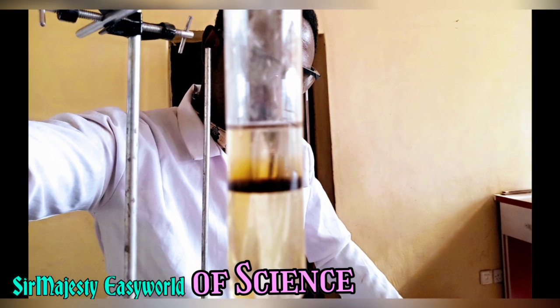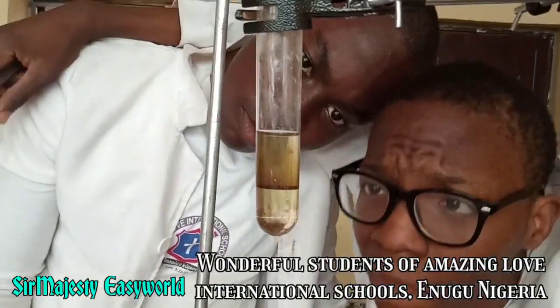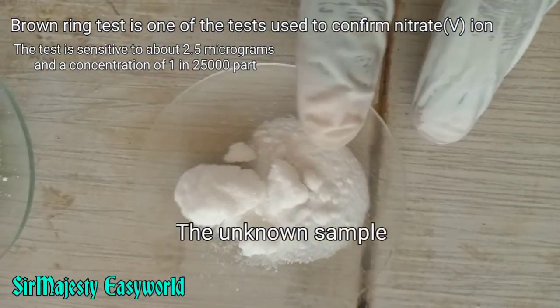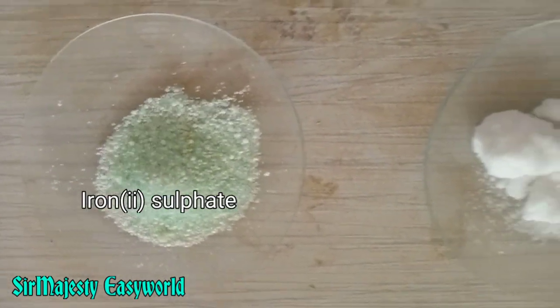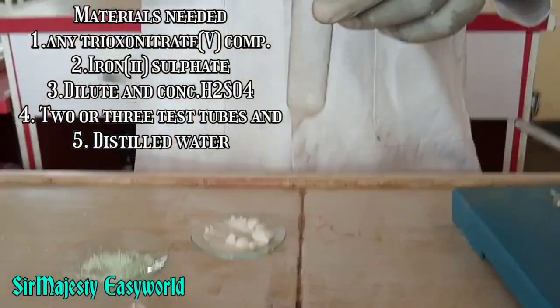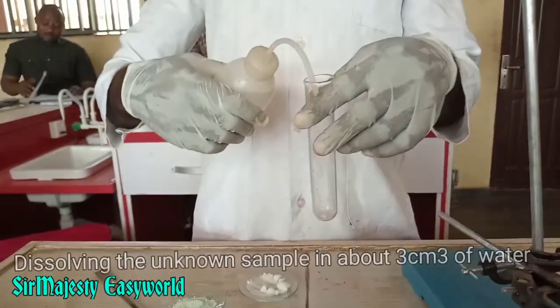Hi, this is Majesty Easy World, the home of easy understanding of science. Here we will carry out the Brown Ring Test, one of the tests used to confirm the presence of nitrate (NO₃⁻). It is sensitive to any compound containing NO₃⁻. We need iron(II) sulfate, any nitrate compound, concentrated and dilute H₂SO₄.